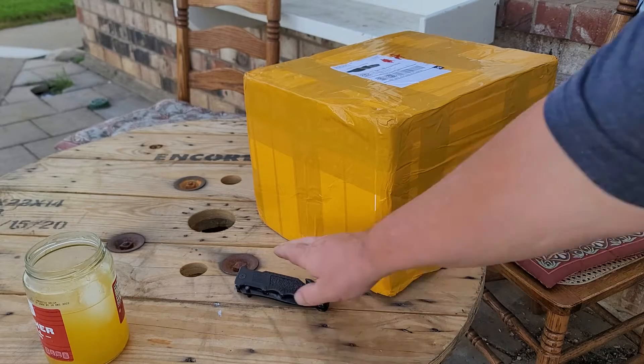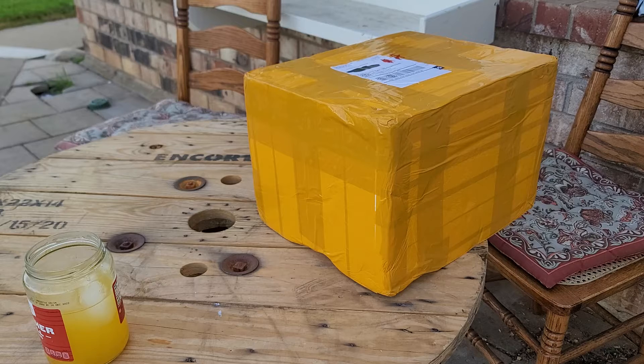Hello there, this is Steven School. I got a package. I came home, there was a package here, and I think it's my Alembic Distillation Head for Alchemy. Let's open it up and see what's in the box.